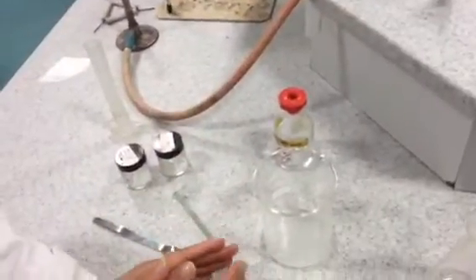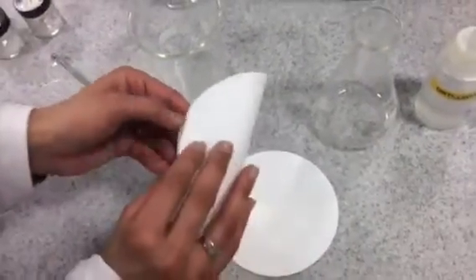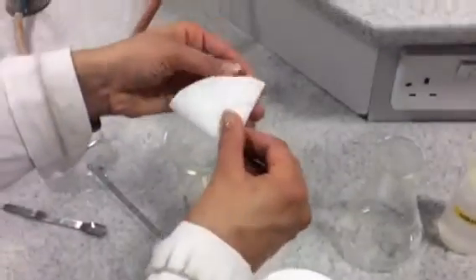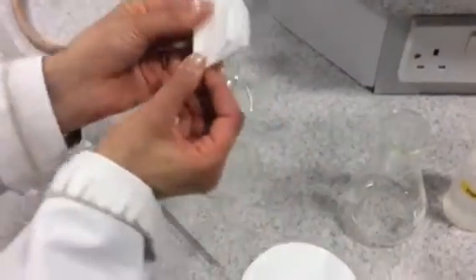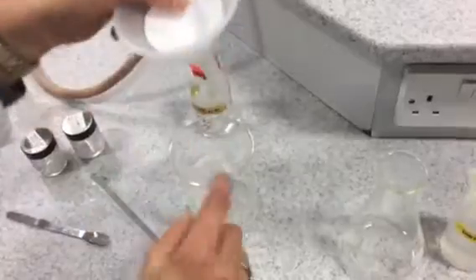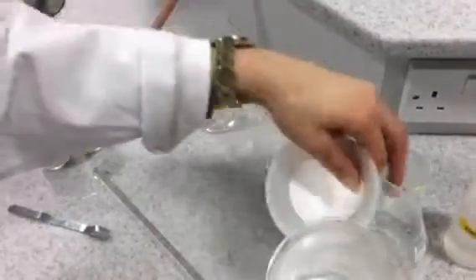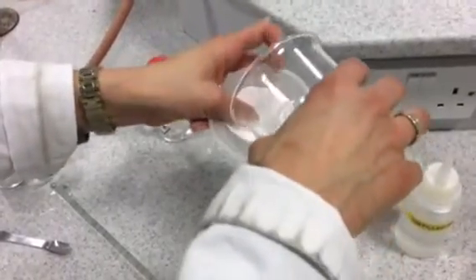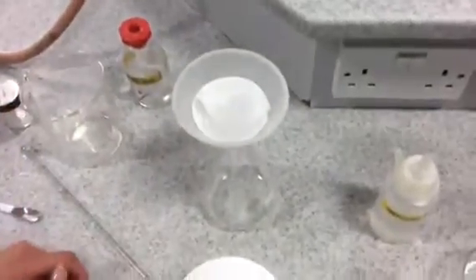What we need to do is filter the excess magnesium carbonate using a filter paper. Take a piece of filter paper, fold it in half and fold it in half again. Open it up, place that into a filter funnel and we're going to filter our solution of magnesium sulfate and excess magnesium carbonate to remove the excess magnesium carbonate.